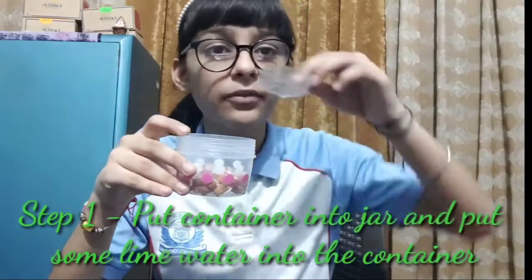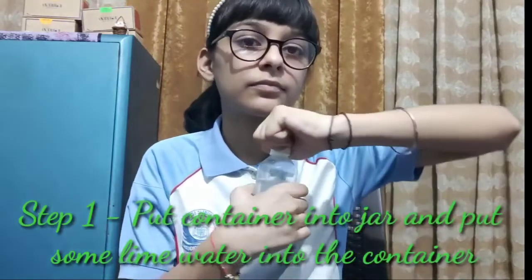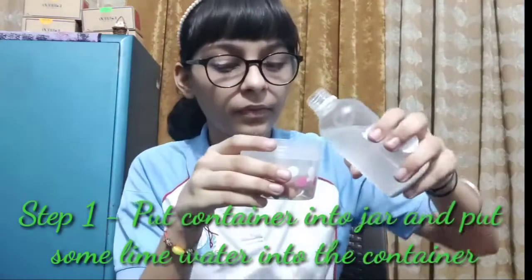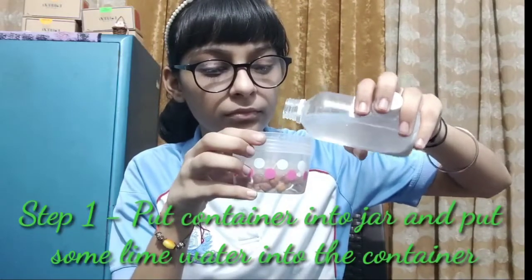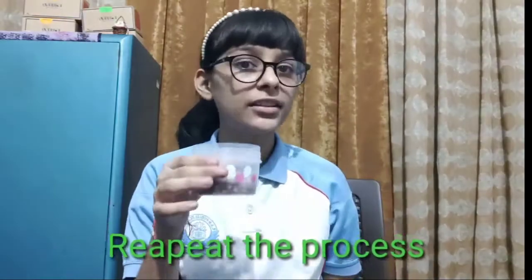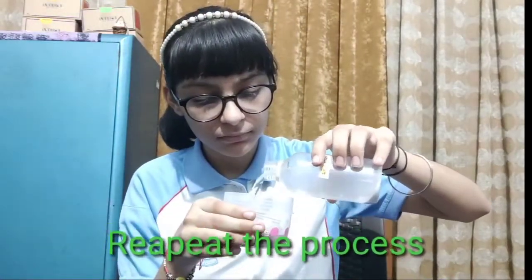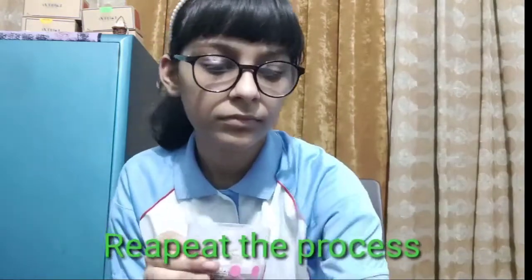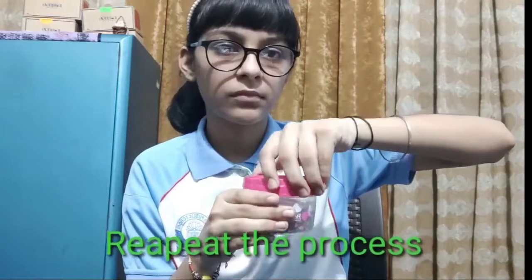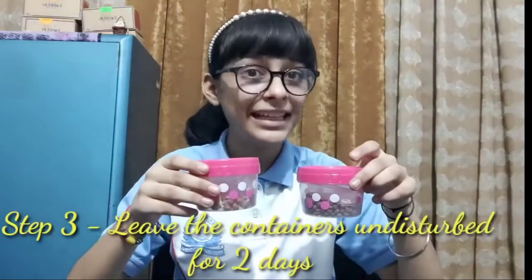First, take one of the jars and put one of the containers into the jar and put some lime water into it. Close this jar and put it aside. Now take another jar and do the same procedure with it. You have to keep these two containers undisturbed for at least two days.